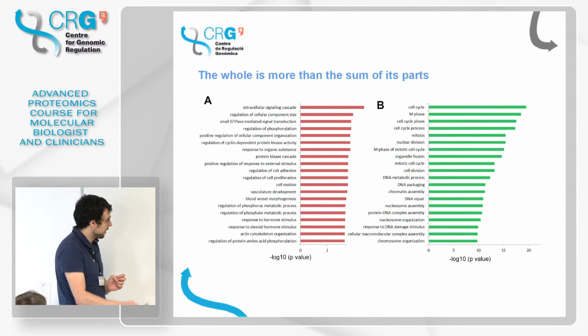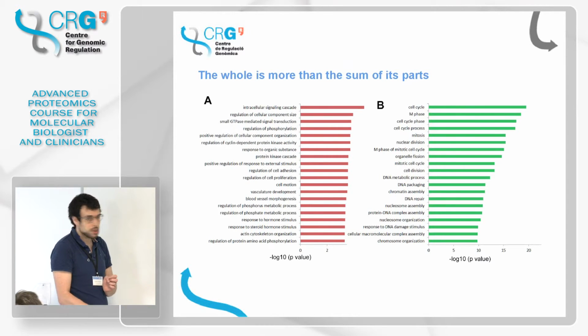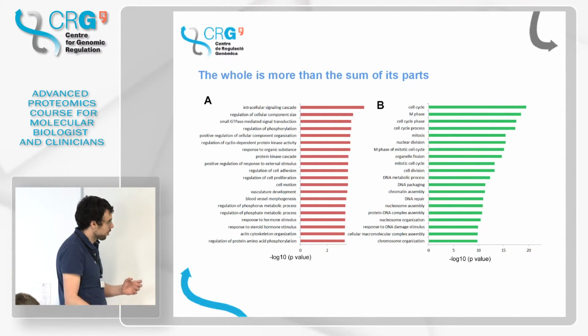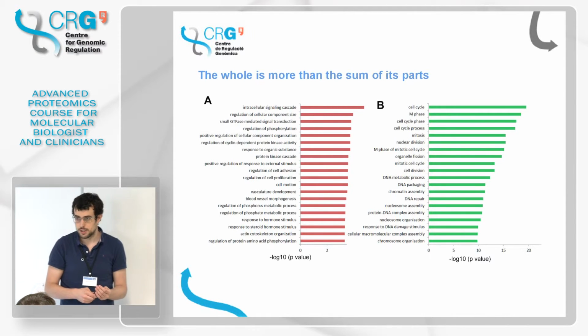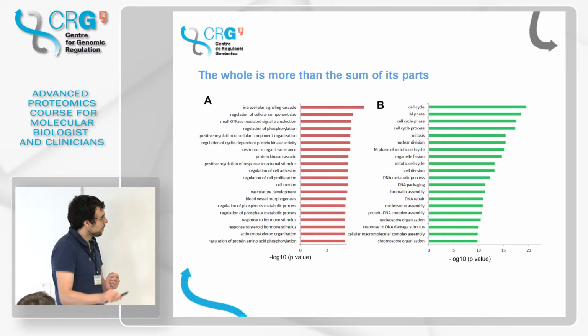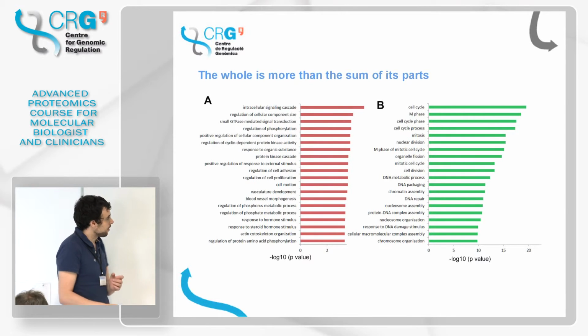which is actually a list of GO enrichment terms and a p-value, okay? And saying that, well, my significant proteins are related to all these processes with a p-value of less than 0.05, for instance, okay? But this should not let you forget that these GO terms are hierarchically structured and that there is a lot of redundancy within these tags, right?